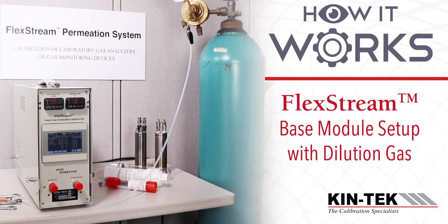Hi, I'm Danae Brazel with Kintek Analytical. Today I'm going to show you how to set up your dilution gas or your nitrogen cylinder to a FlexStream base module.